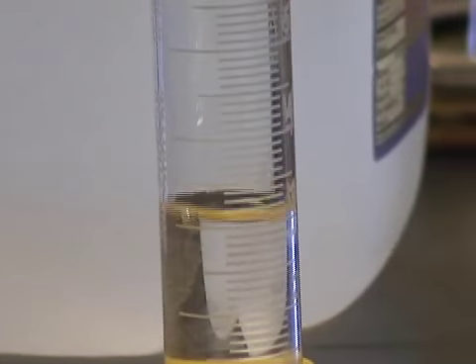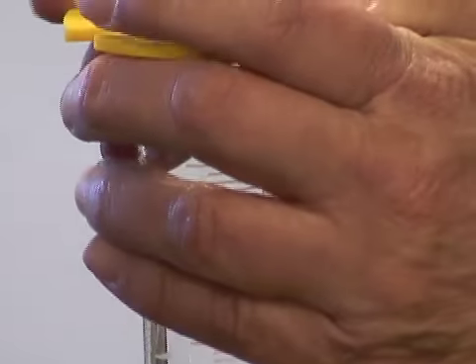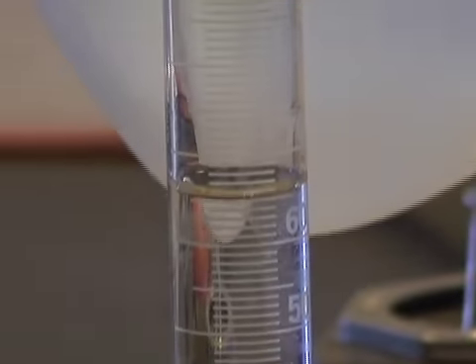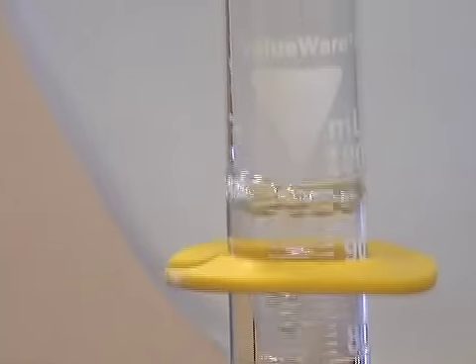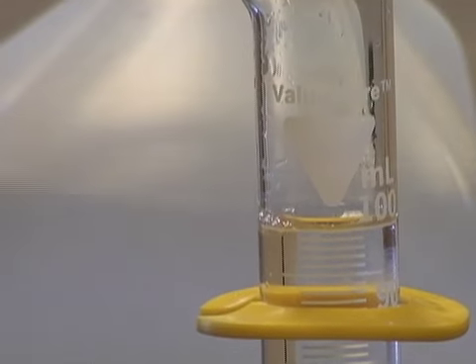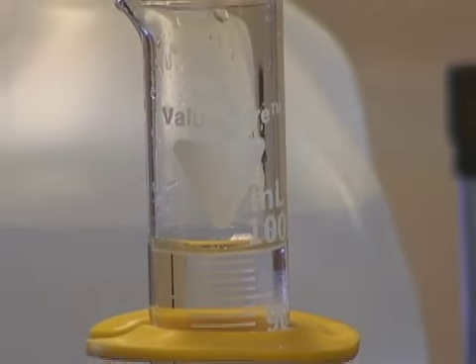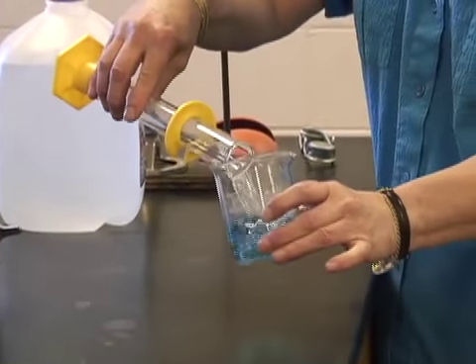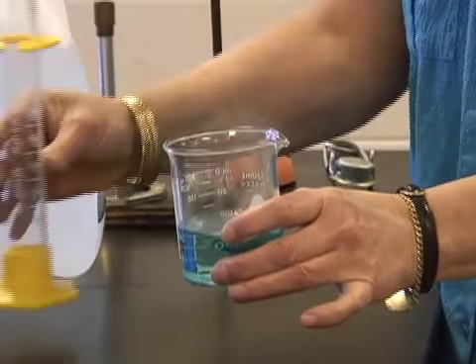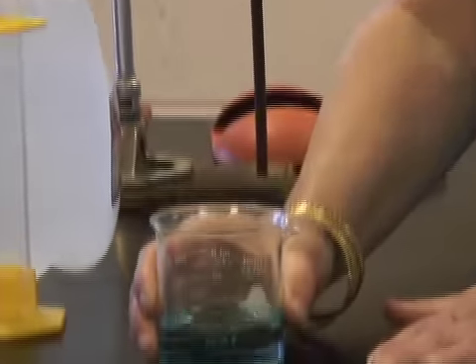So I need to make sure, oh, I wanted 100 milliliters. I'll get 100 milliliters here. Now it's very difficult to see where the 100 milliliters is if this thing is there, so I will remove it and then add my water. And that's pretty amazing. It's 100 milliliters of distilled water. And I am going to add that to my solution here. And you can see it's a beautiful, beautiful blue.